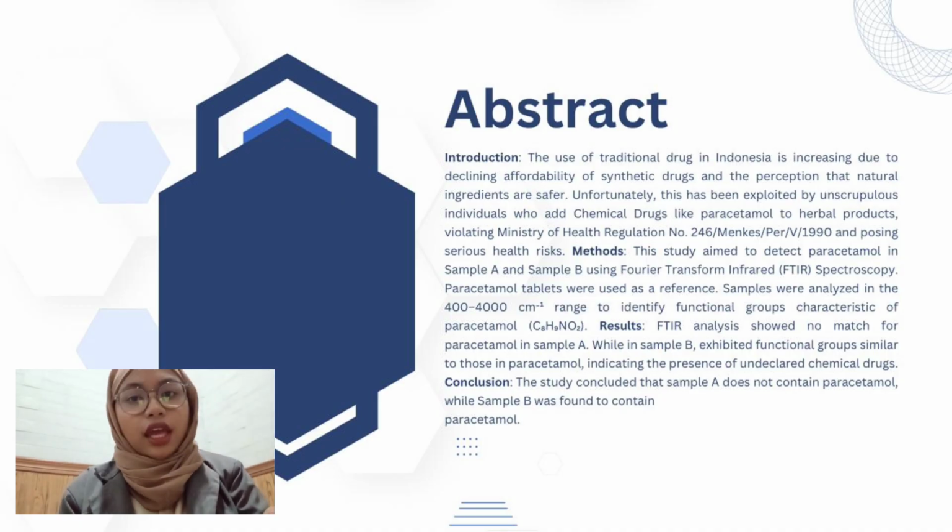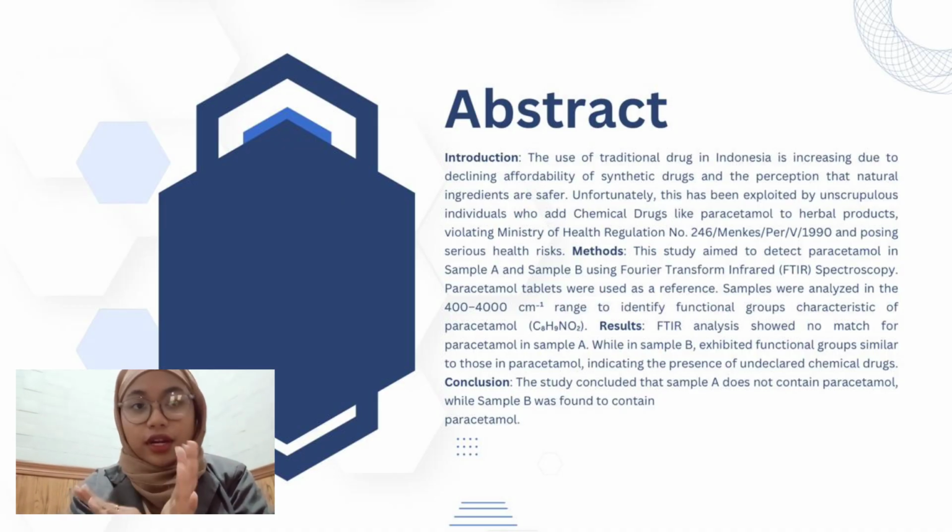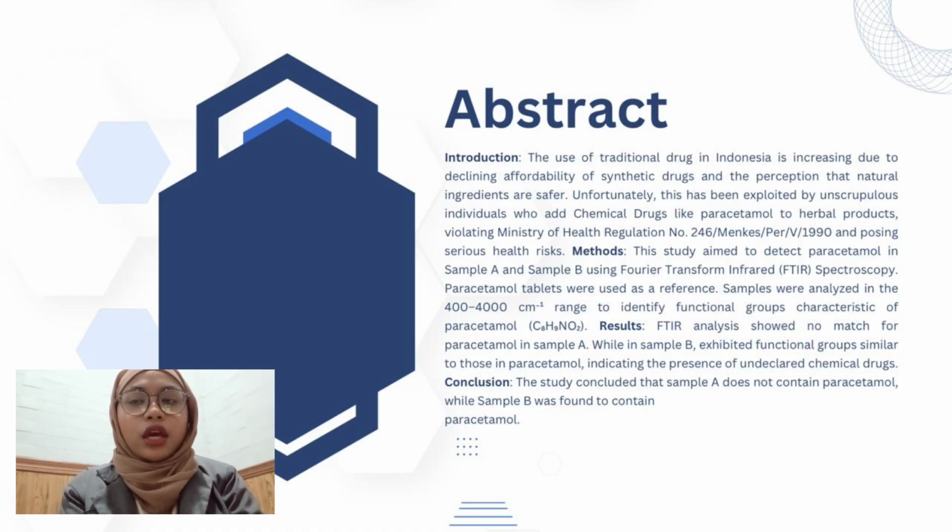The result: sample A shows no match with paracetamol, so it appears clean. Sample B, however, exhibited spectral peaks matching paracetamol functional groups, indicating undeclared addition of the drug.